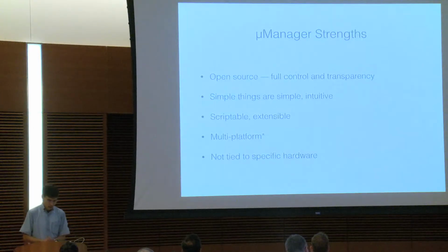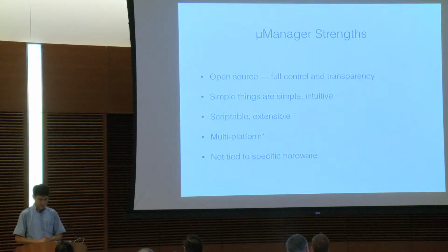And so I've talked about open source. The other characteristics that we like to stress about µManager is that simple things are possible through an intuitive interface. So a basic image acquisition experiment is very easy to understand. But if that's not enough for you, you can script µManager. You can extend it in various ways that I'll talk about a little bit.